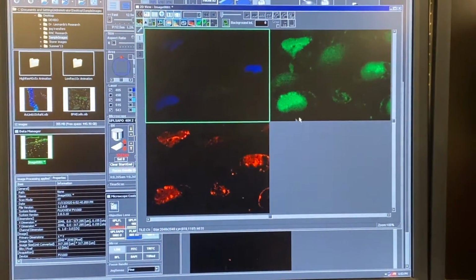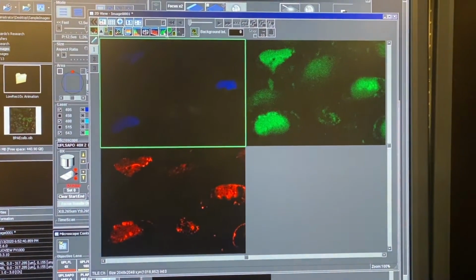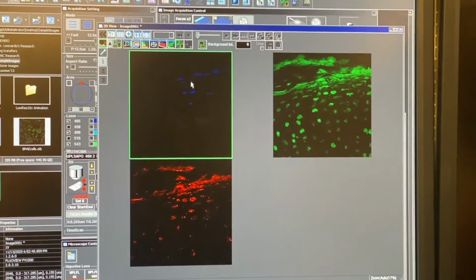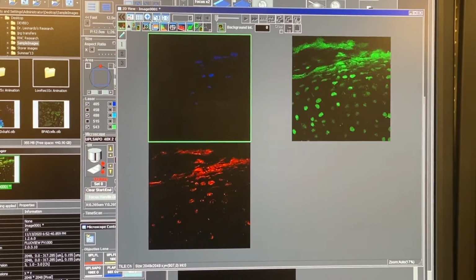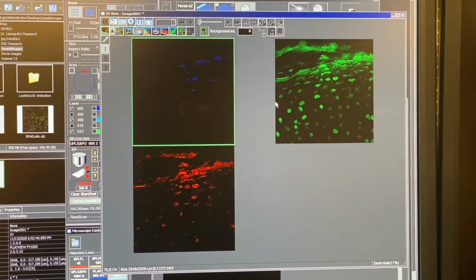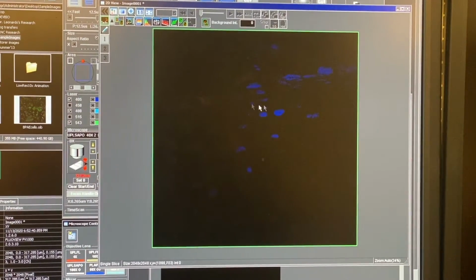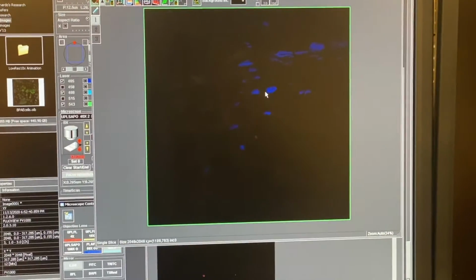So here's the finished image, and now I'm zoomed in, or I can just immediately hit this button and zoom back out. So a single click of a button lets me zoom in and zoom out. That's enjoyable. Okay, the other thing I can do here is if I just double click on this image, I can select it as the one I want to look at right now.